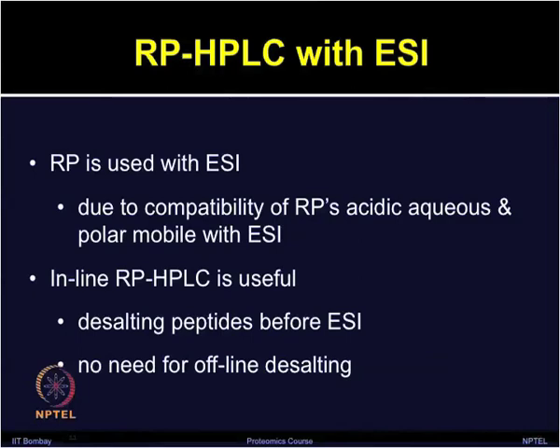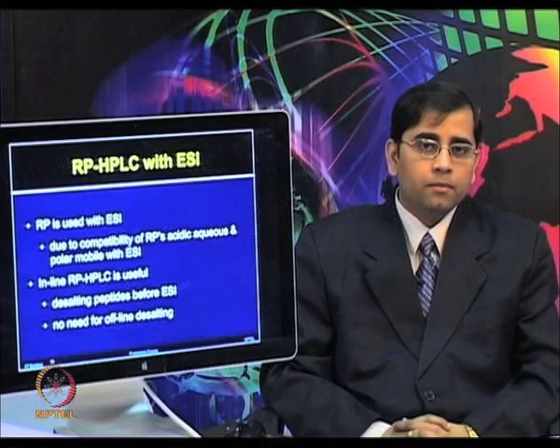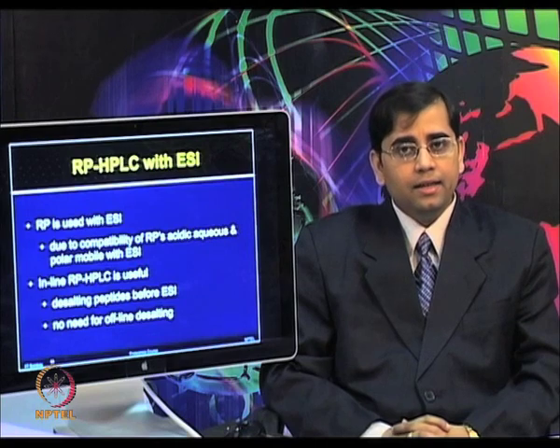The inline reverse phase HPLC is very useful because it can do the desalting of peptides prior to ionization in ESI. There is no need for separate offline desalting and pre-fractionation. It can focus peptides from dilute samples into narrow chromatographic bands, and it also enhances the sensitivity.